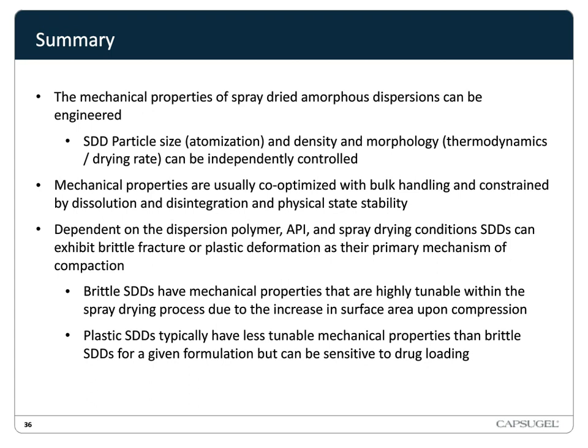And brittle SDDs have mechanical properties that are highly tunable within the spray drying process, and this is due presumably to an increase in surface area upon compression. And plastic SDDs typically have less tunability because we're not really creating any new surface areas. We're just allowing those surface areas to plastically flow together. So they have typically less tunability than brittle SDDs, but nevertheless can be tuned as well.